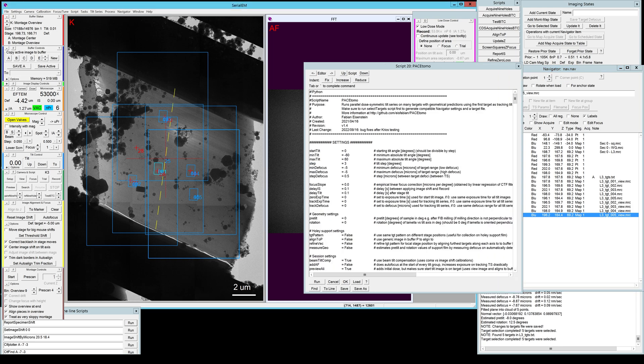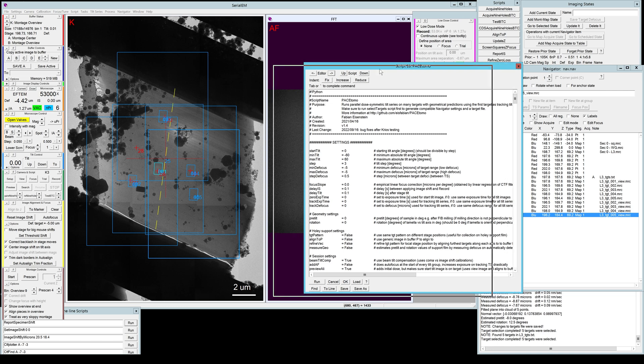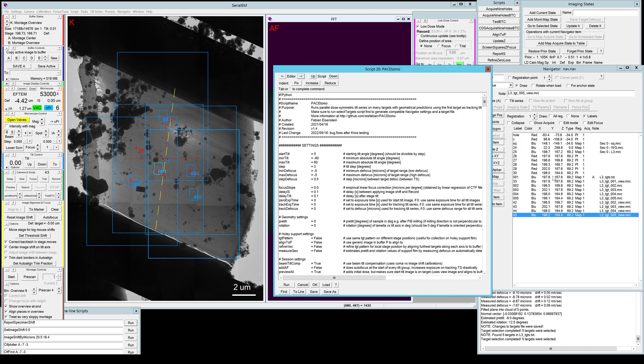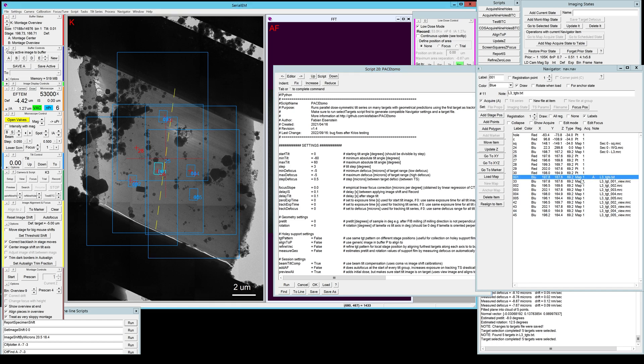I already copied the PaceTomo script into the SerialEM script editor as you can see here, and of course we have all our targets in the navigator. It's important to note that only target number one or your tracking target has the acquisition mark and has the text file containing the target information.